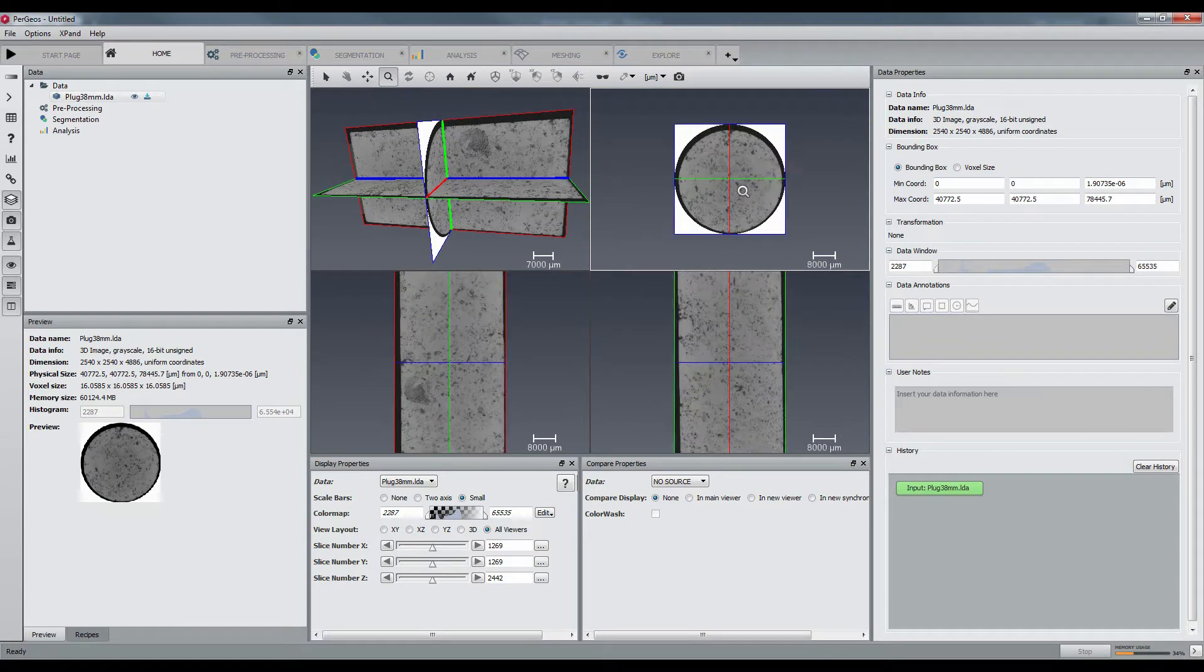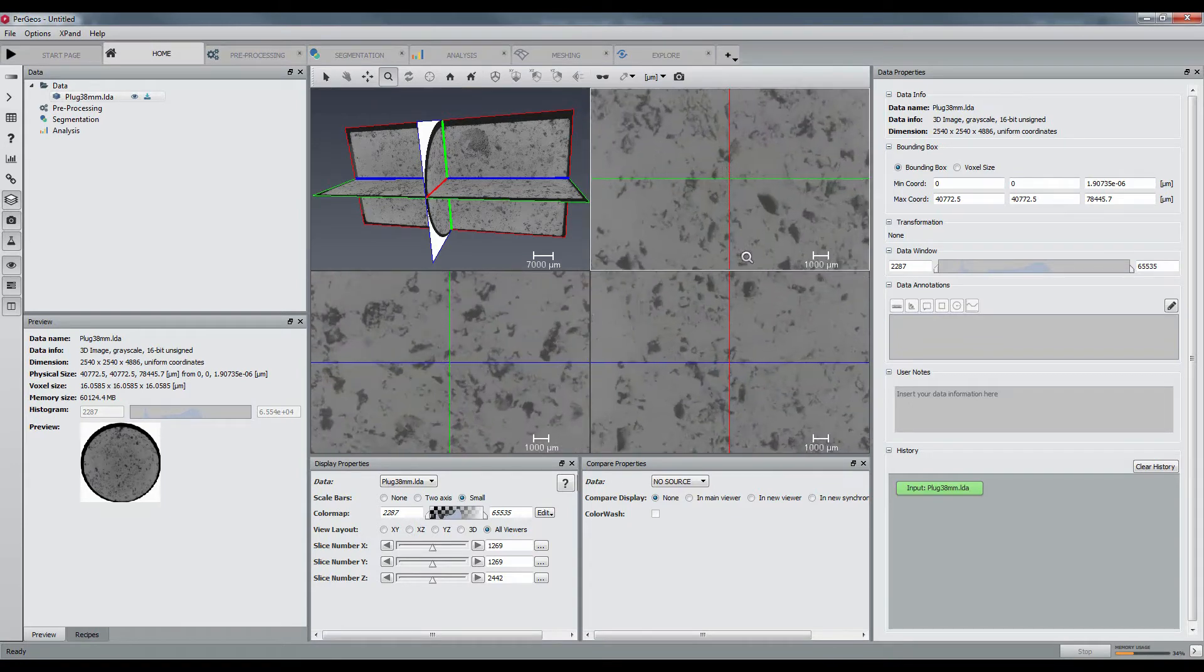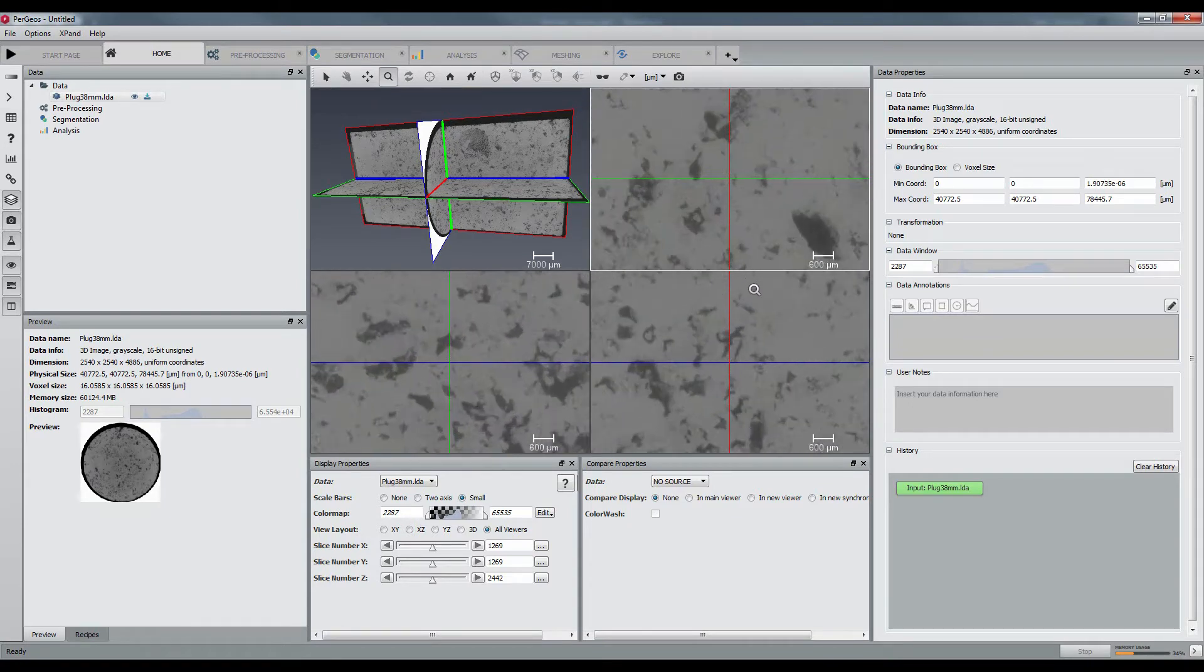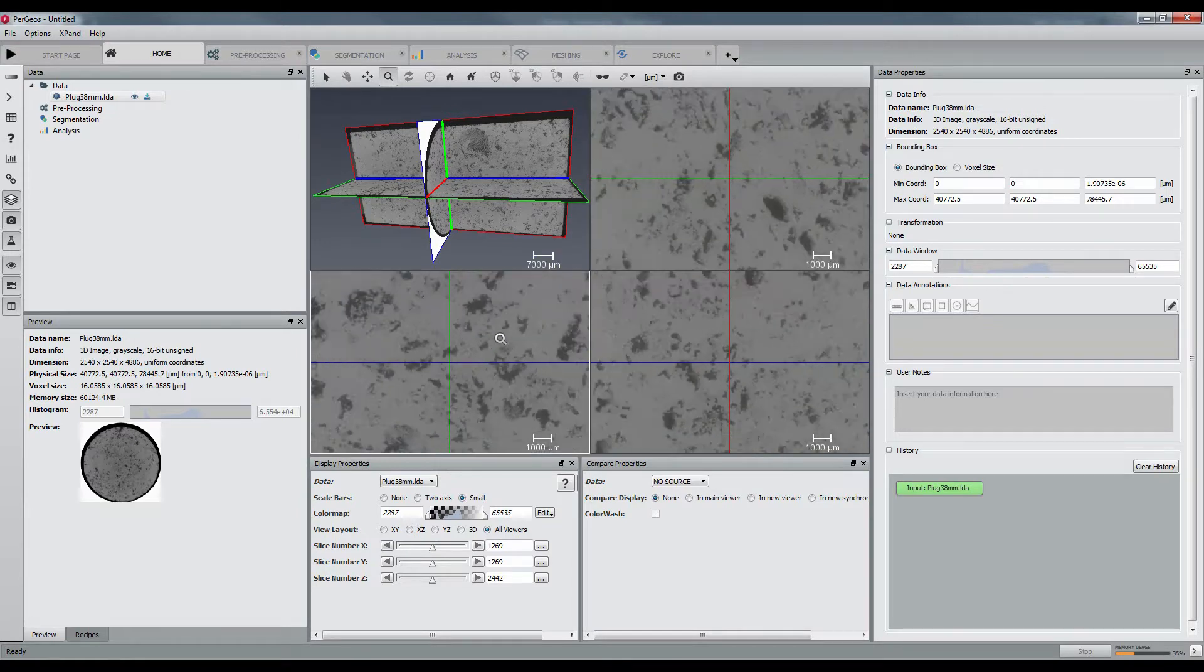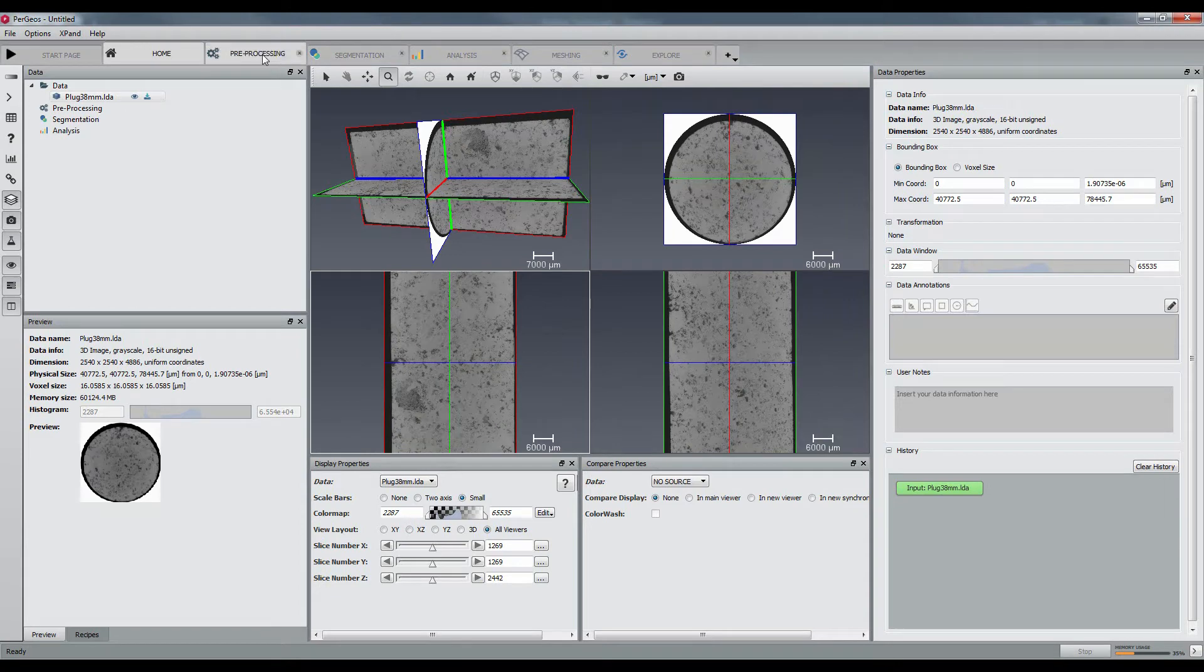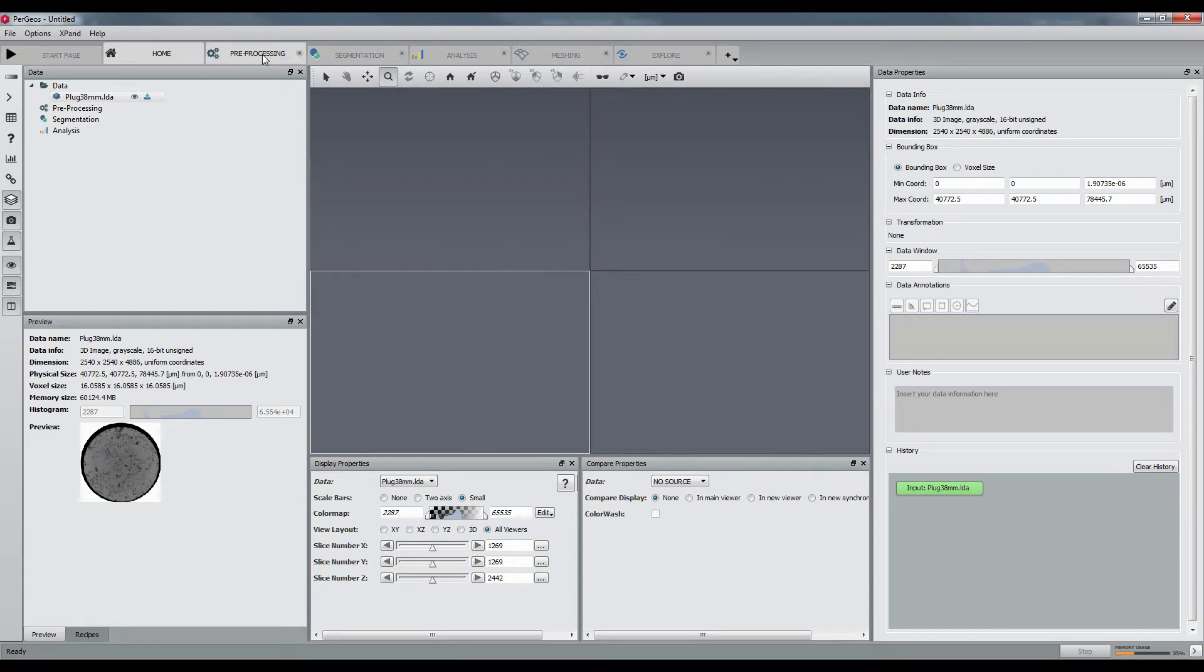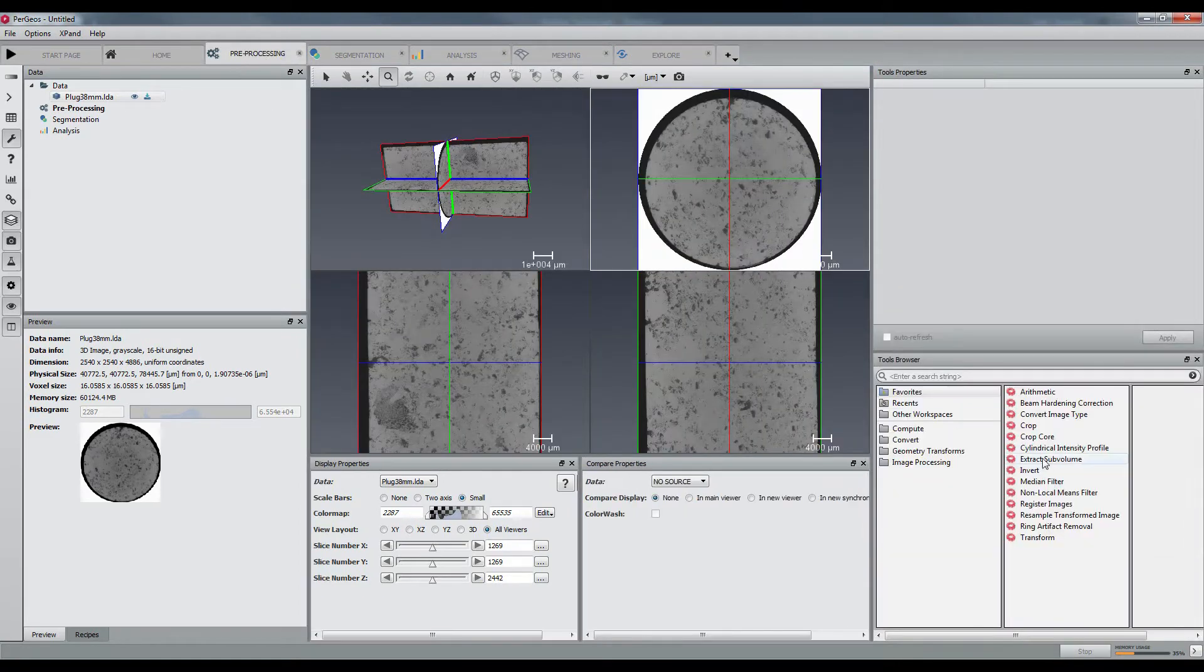I will explain here how Pergeos can segment the pore space of a 60 gigabyte data using only a few amount of memory. The 38 mm carbonate plug will be segmented using the slab processing tools.